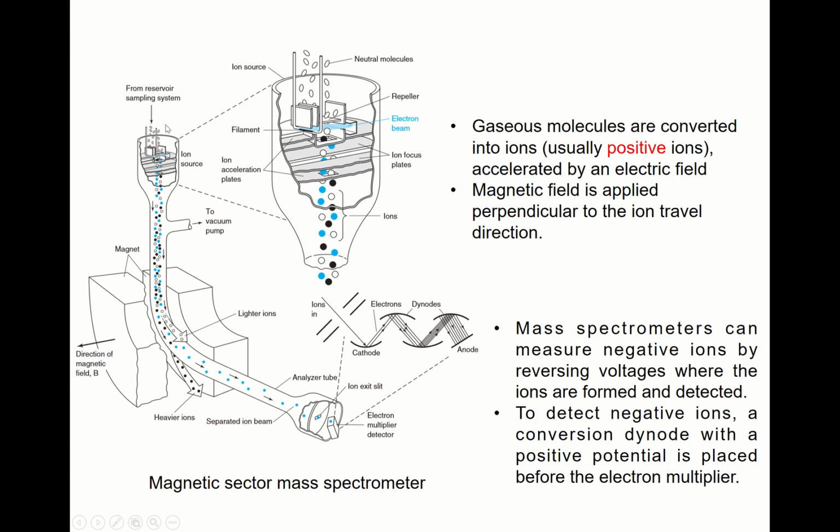Okay, look at that. Here you inject your sample from this part. And then the sample is moving down, and it passes through this magnet. Yeah, in the magnet, its path is bent. Okay, and then it's detected by this electron multiplier detector.